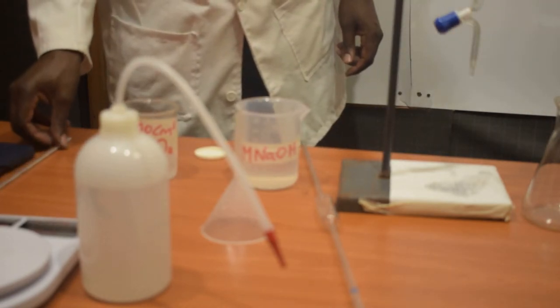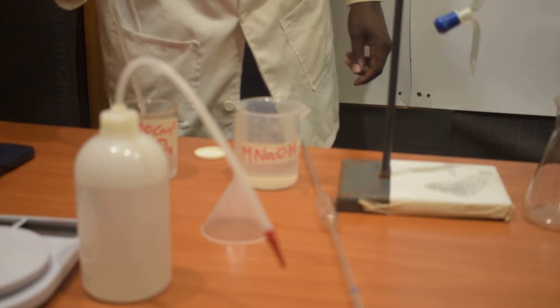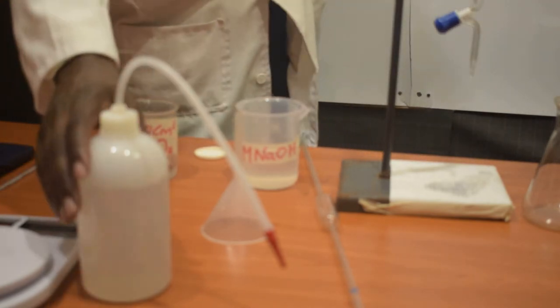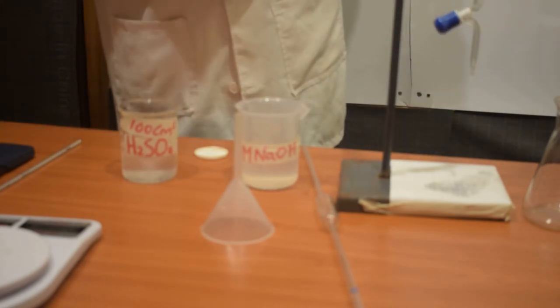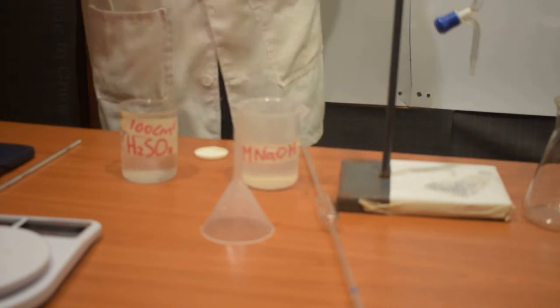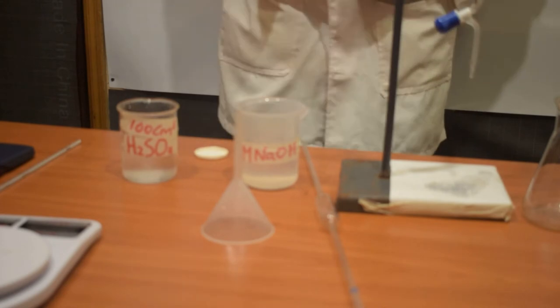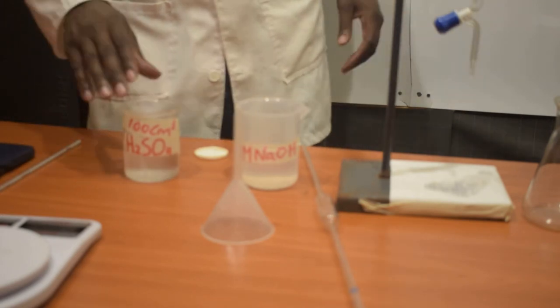Yes, so effervescence is about to stop here. Yes, it is done. Effervescence has just stopped. That means that all the sodium carbonate has reacted with the acid. And what could only remain here now is the excess acid, all the remaining acid. Now, this one is what we'll be trying to analyze. If you like, you can call it the analyte.